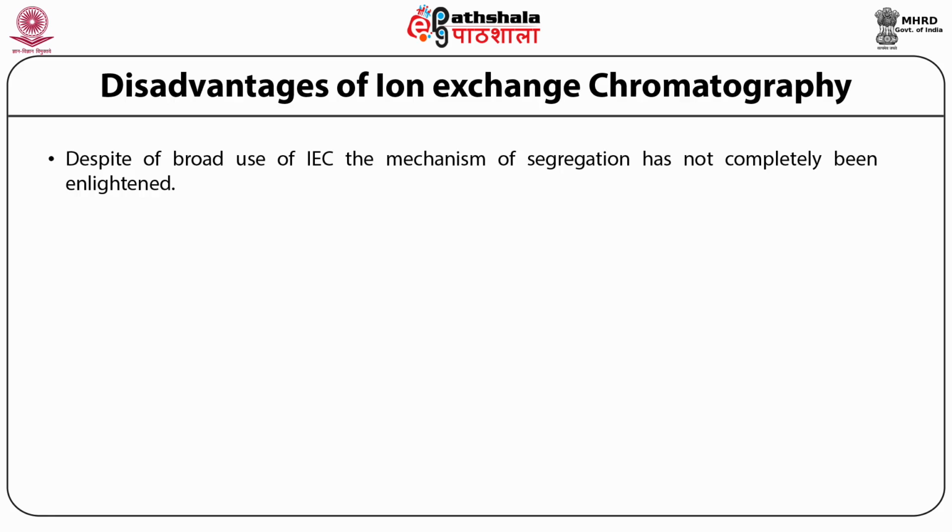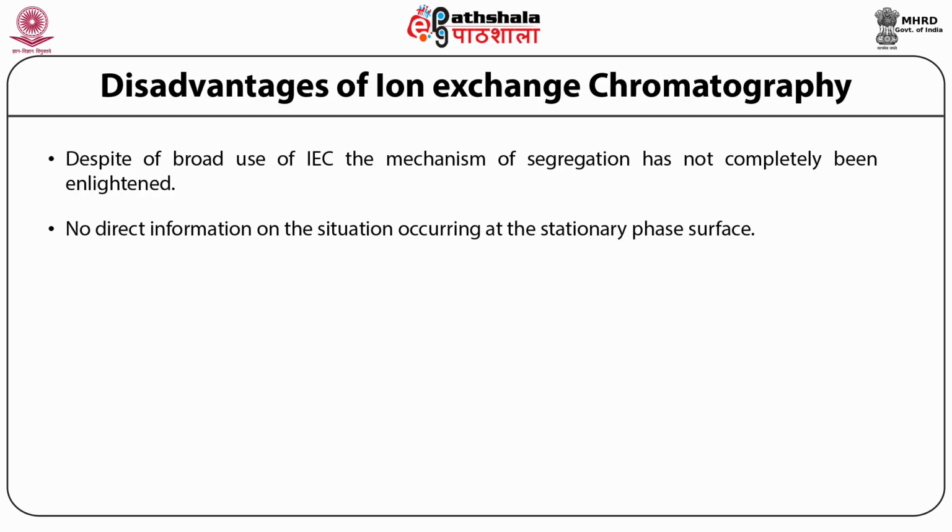One of the major disadvantages of the IEC technique is that it presents no direct information on the situation occurring at the stationary phase surface, as the ion exchange equilibrium is always determined by the balance between the eluent and solute interaction with the active site of the resins.